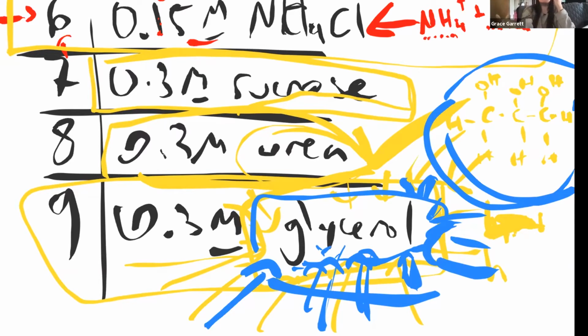Would you consider time one of them? Well, for glycerol, yeah. Actually, for glycerol, that is a source of variability. For this one that is slightly permeable, if you let it sit for a long time before you check versus you just put the cells in the glycerol solution and spin them down, you get really different results.